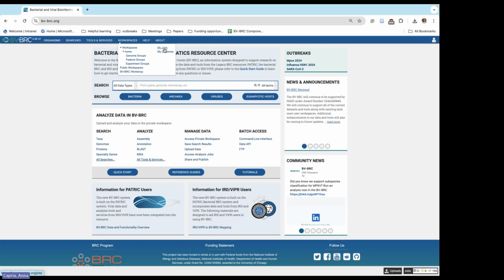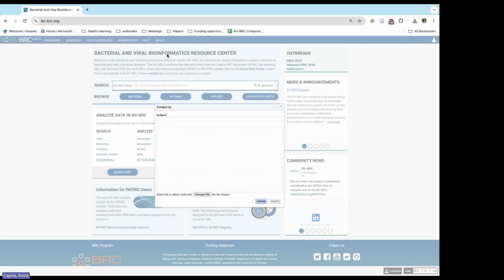Then you can access your jobs from up here, as well as down at the bottom right-hand corner. You can see how many jobs you've run and if you have any running, and then any of your genomes that you've added yourself. We have our help documentation website, and our news and announcements and reports and analysis are found here. And this has really got some good resources to get comfortable with the BV-BRC. Then our about us and contacting us. And if you ever have any questions, under about us, you can hit contact us, and that will pull up a contact us form, and that will get sent, and someone from our team will answer that.